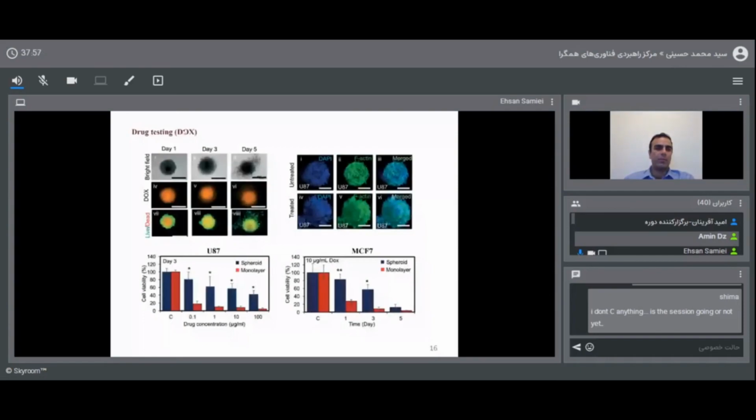Here you can see the image of the spheroids on the platform itself, which shows great potential for real-time monitoring of the spheroids. This loss of integrity could also be used as a parameter for analyzing the effect of the drug on tumor spheroids, which can also be observed in the confocal image when comparing untreated and treated spheroids.